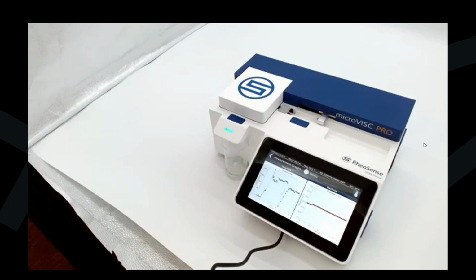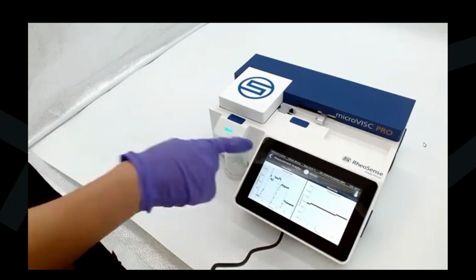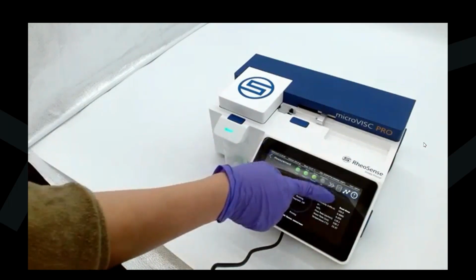This priming feature consists of 3 steps. Right now it just finished running the second step, and then it's going to do 1 more after this. Now it's running that final step, and if we go back on this window, we can see the real-time data being shown there on the right.